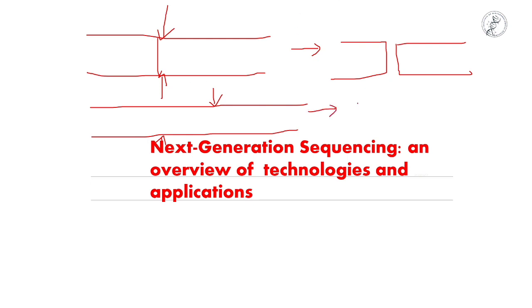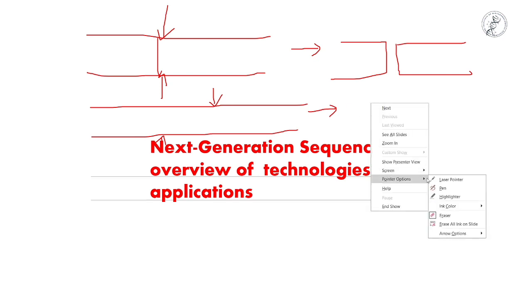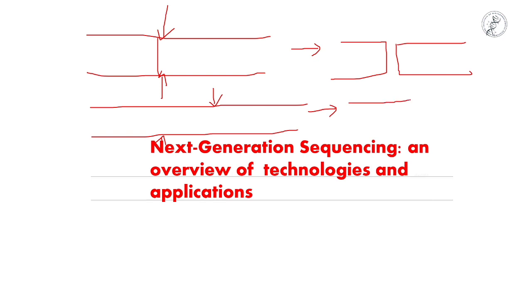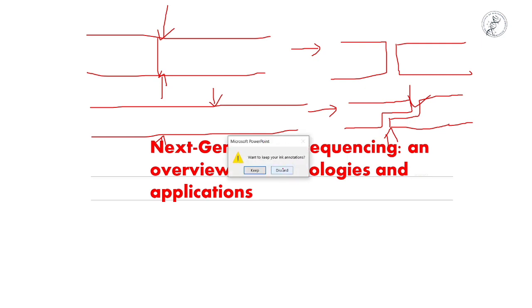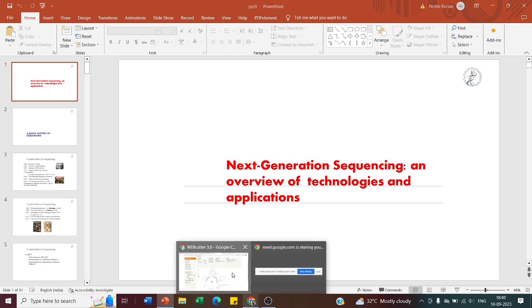Some enzymes cut to get sticky ends, the ends which can easily get ligated. So some enzymes give sticky ends, while some enzymes give blunt ends. These are the two types of cuts restriction enzymes can bring about. Which enzyme cuts in which way, the NEB cutter will tell us.